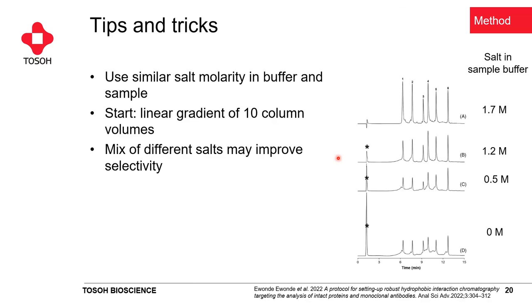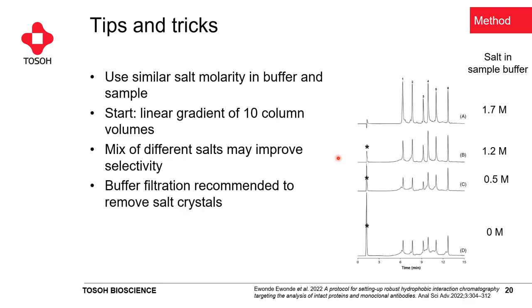Next, we talked about the type of salt that you can use in your separations. What I did not mention yet is that if you have the time to test a mix of several salts, this may also have a positive impact on your selectivity. So you can tune the selectivity, but it's a lot of trial and error.